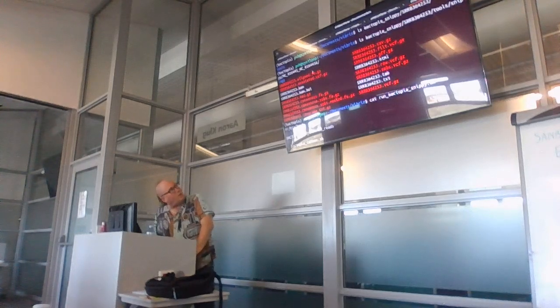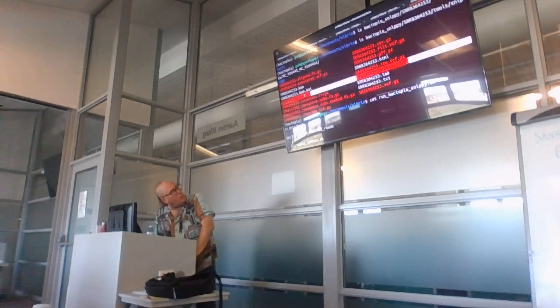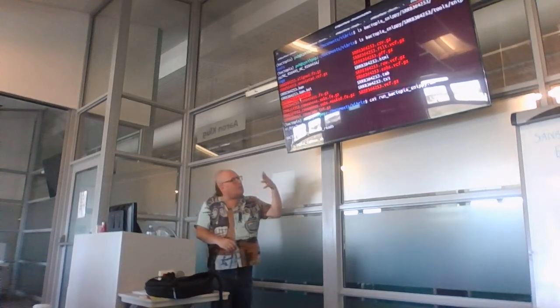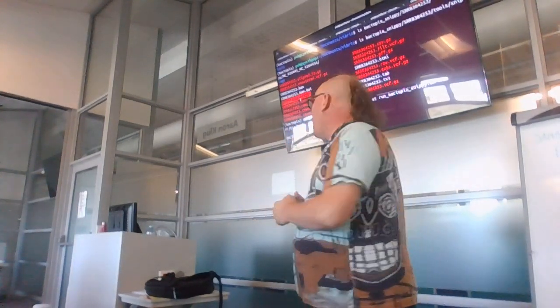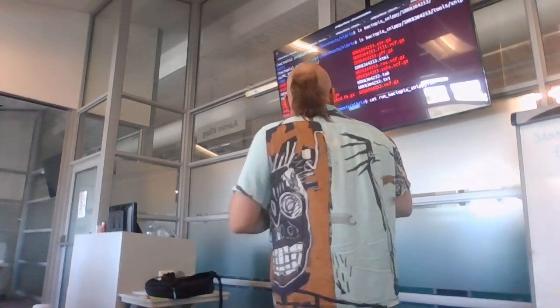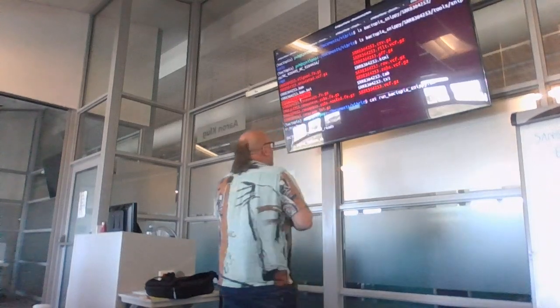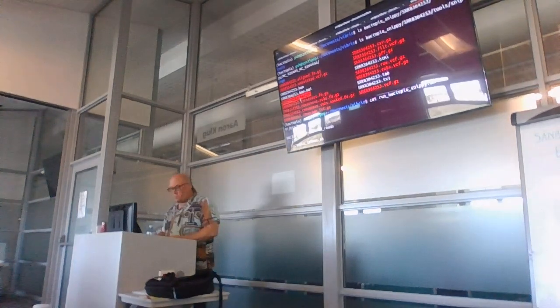is. Okay, so over here, this is just a tabular variance. This is the variance in bed format and so on. They've all been compressed. Okay, and these are produced for every individual sample. So we've got one of these for every sample. Okay. Then the other thing that we get. Okay. So this is what you're getting for each sample, and you can look at the VCF, and we will look at the VCF later on.